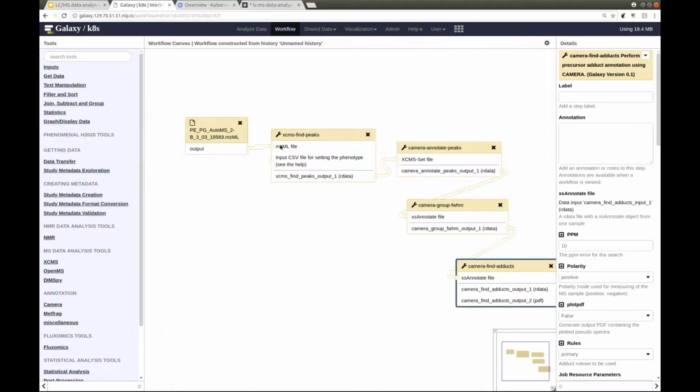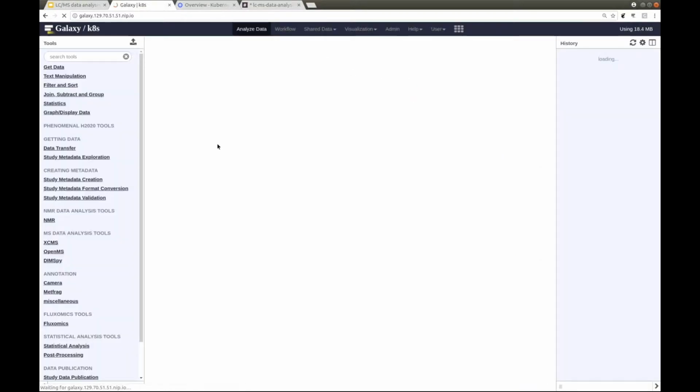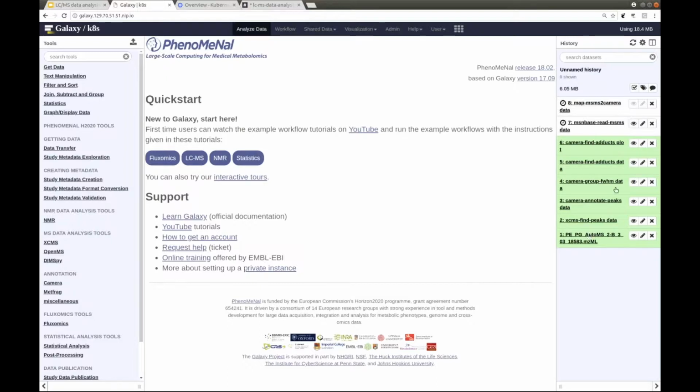And this way, we are gradually creating the workflow. We could also drag tools here on the workflow editor, but these are two different approaches to creating your workflow. The one we see here is using the editor and really assembling the workflow. And the other one that we have done so far is sort of interactively running the individual tools on particular inputs and then en passant creating the workflow.